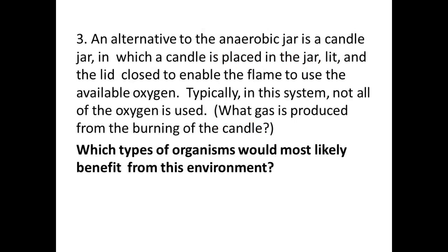So an alternative to the anaerobic jar is a candle jar. You'll see I have some old pickle jars here. You could put a candle in this jar, light it, and seal up the jar. What happens is when the candle's burning, it's going to eliminate most of the oxygen, not necessarily all of it, okay? So your really strict anaerobe isn't going to grow. But another gas is produced from the burning of the candle.